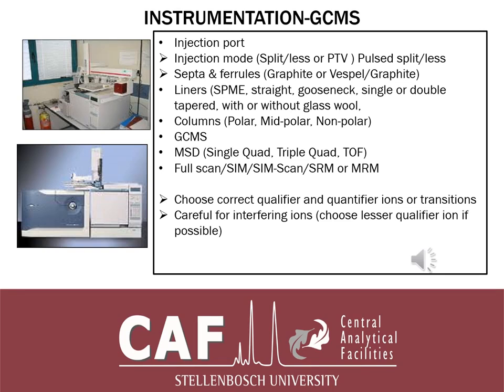Two minutes is sufficient, and after two minutes, the pressure will drop down to the operating head pressure that you had of 50 or 60 in the beginning, right through the injection of your compound. That also helps to improve the sensitivity of your method based on the instrument. Remember when I talked about the sample earlier on, I said one has to first try to improve the sensitivity from the sample prep before looking at the sensitivity from the instrument. They go hand in hand, but first with the sample and then on the instrument.